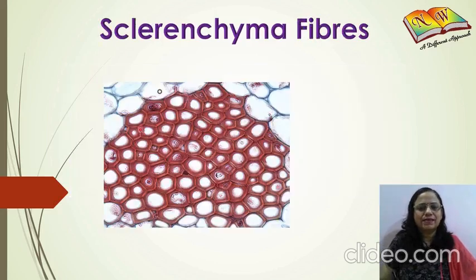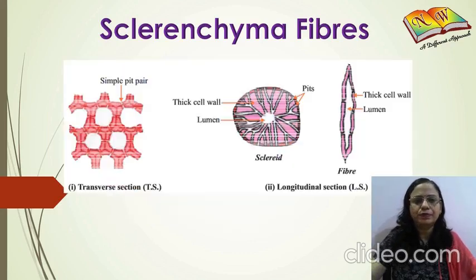This is the microscopic view of sclerenchyma fibers. So when your teacher shows the slide of sclerenchyma under a microscope, you will see something like this. Let us understand the structure of this now.